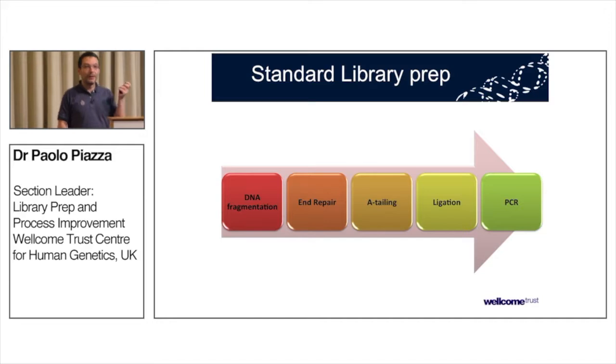does this still work? And the reason why I'm particularly interested in testing these is for 2 reasons. One, it would provide a case to demonstrate that you can do more complicated workflows, where you can keep adding reactions to it, and SmartSeq2 is an obvious member of this category of workflows, if you like. And the other thing is that this protocol is sometimes better suited for bacterial genomes than Nextera, which is very sensitive to concentrations and quality of DNA.